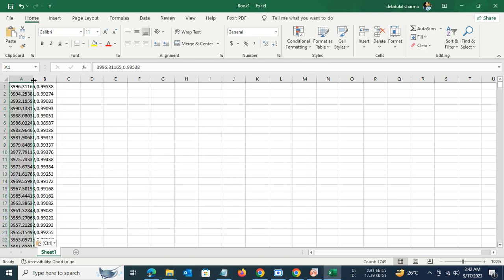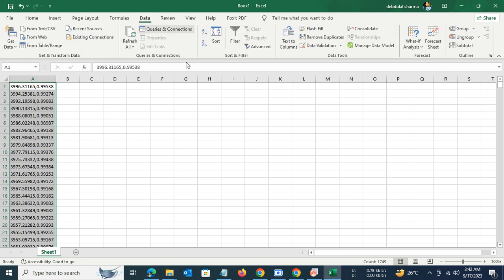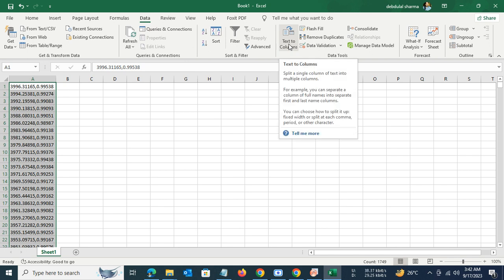Then select the entire column, go to the Data heading, then go to the text to column transfer feature. What the text to column feature does is it splits a single column of text into multiple columns by removing markers such as a comma, period, space, tab, or any other character.